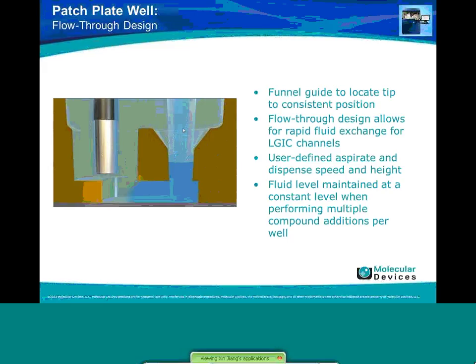When you add compound from the pipette tips, it flows through one end of the well to the other. So it's kind of a flow-through design, which is similar to the perfusion system, where the compound or ligand flows from one end of the chamber to the other. The user can define from the software the speed and the height of aspiration or dispense.